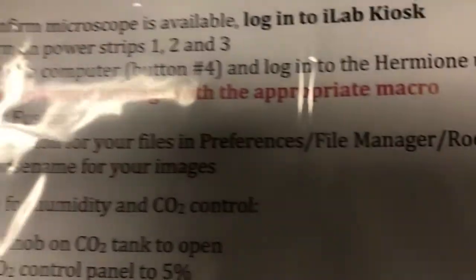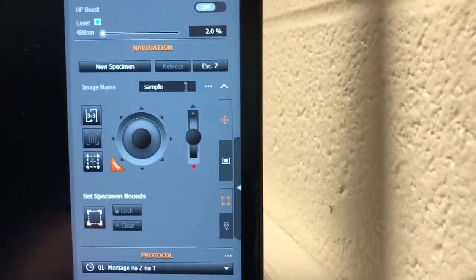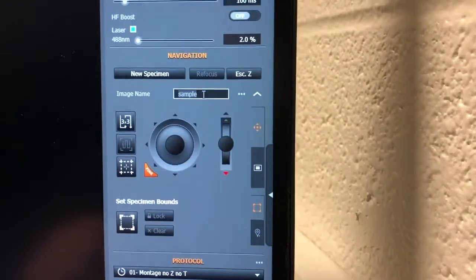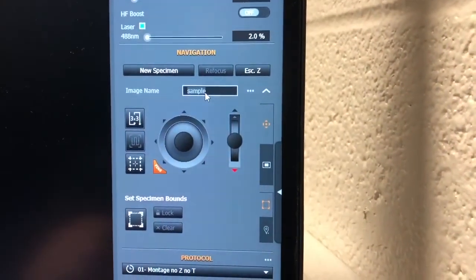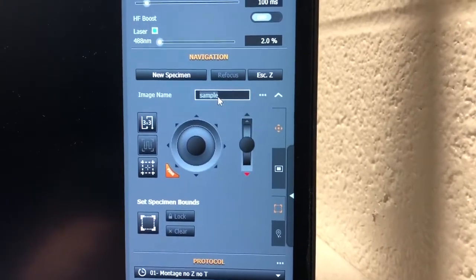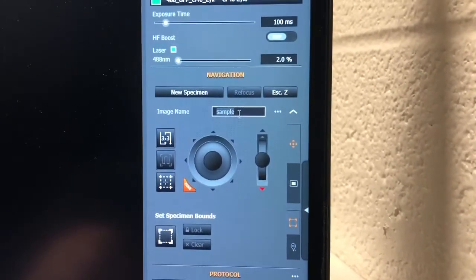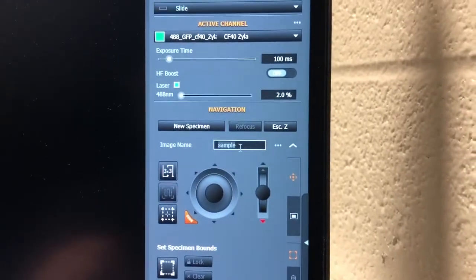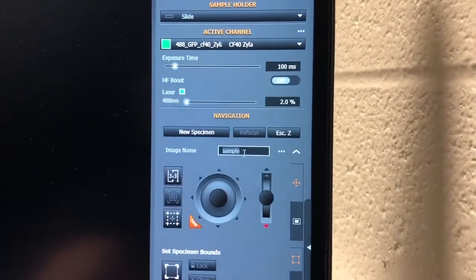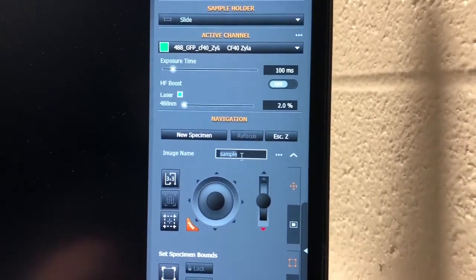The final step of this section of the startup is to set a base name for your images. You can just provide a base name, and that will appear at the beginning of each of your subsequent images, which will also have the name modified by the day and time. You can obviously change this whenever you want, but it's a good idea to set something reasonable at the very beginning.